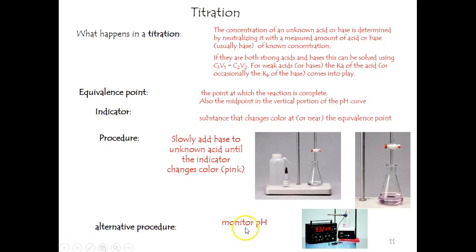Alternatively, you could simply monitor the pH and note that the pH changes drastically when you're going through the equivalence point. That's an introduction to titration.